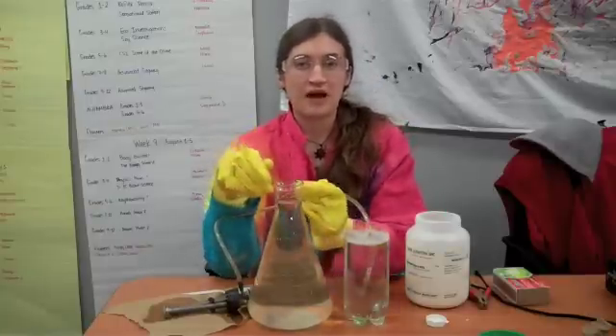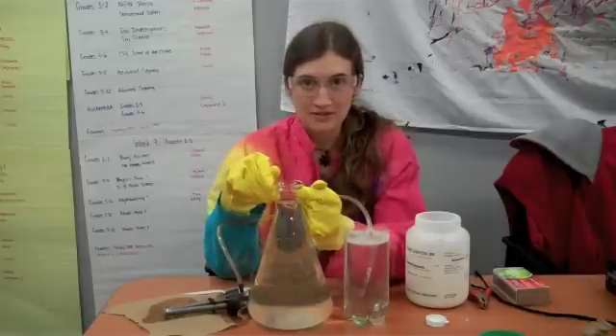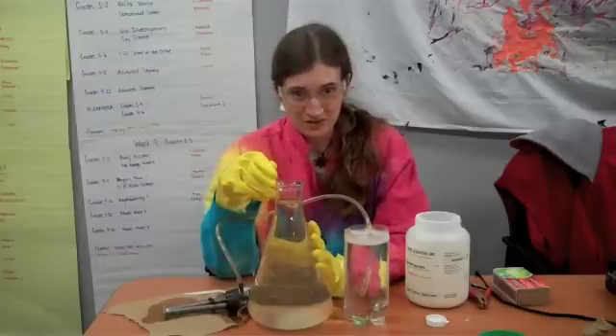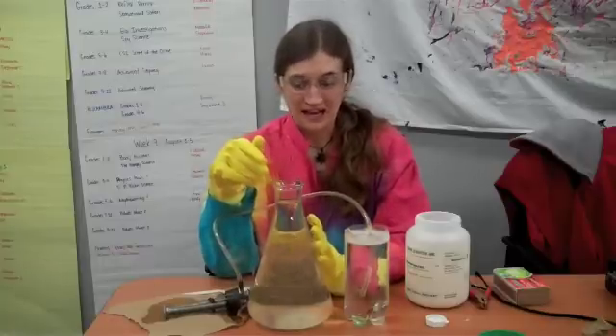What this is, is the electrolysis of water. We're going to split water apart into its components. Pure water, pure H2O, can't really carry electricity. So what we need to do is add some salts in there to get some ions going.